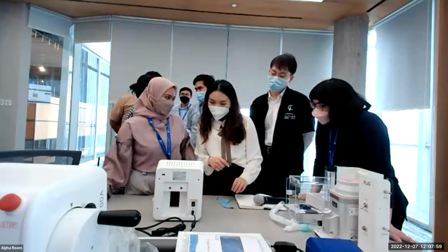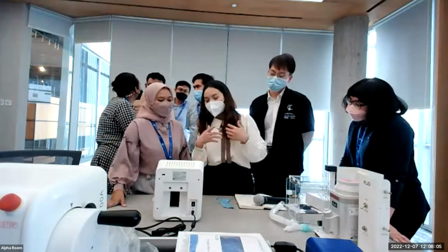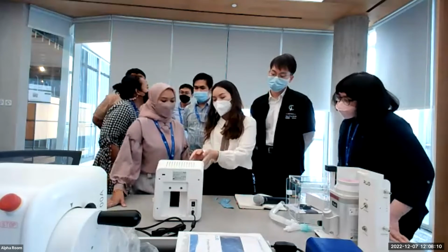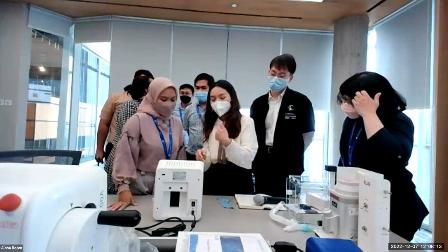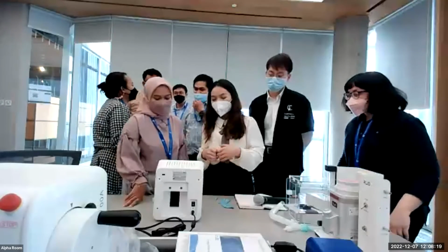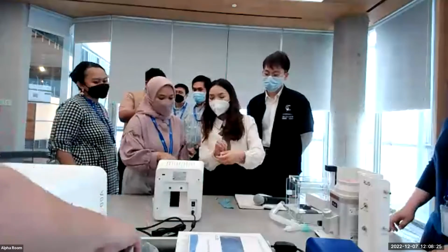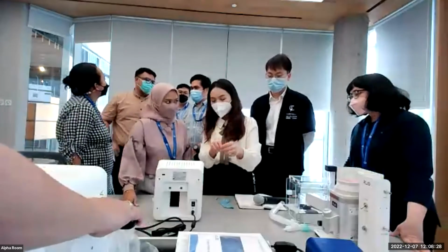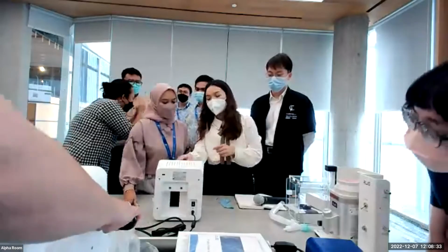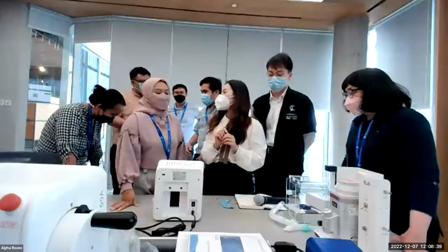How to update the software? The software update is actually for the engineer. If we operate a new program, then you can import it to the device. Or you download the program to a USB beforehand and insert it here, then choose this, and you will see the program here. Just confirm, then the program will be in the device.